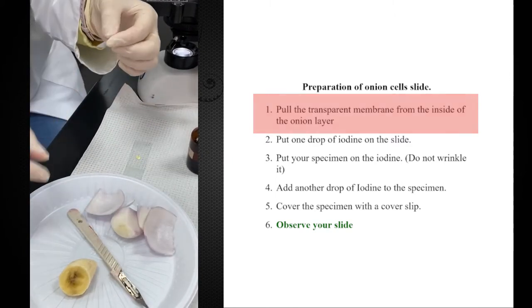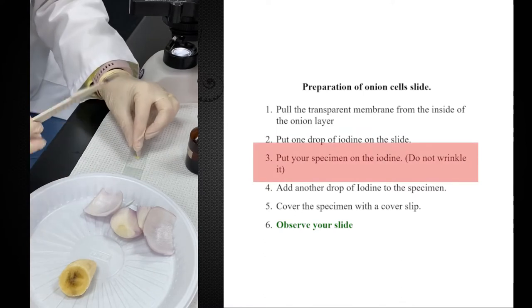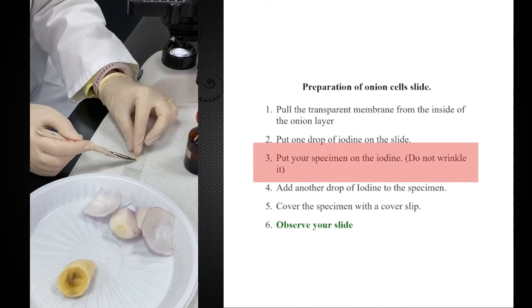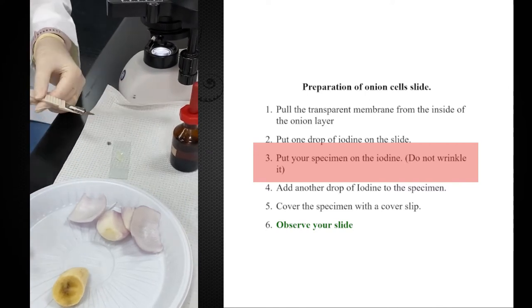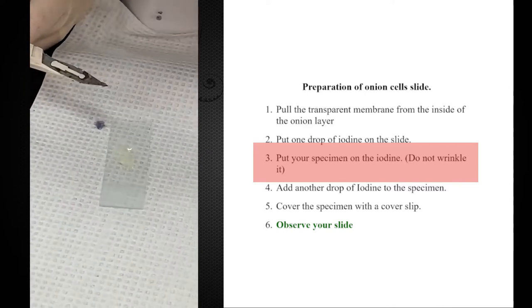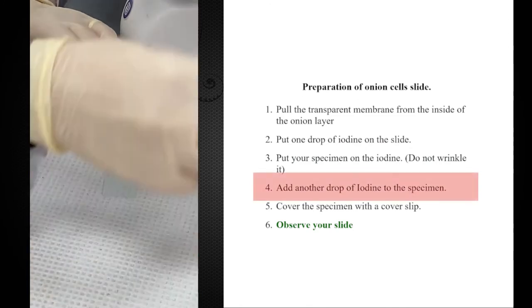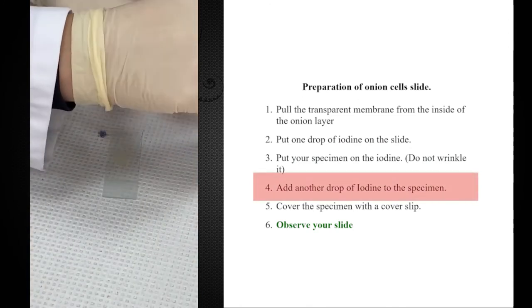I have to make sure that this skin does not get wrinkled in my hand. Yes, like this. I deposit it slowly on the slide and add a drop of iodine. Then I add another drop of iodine on the top.